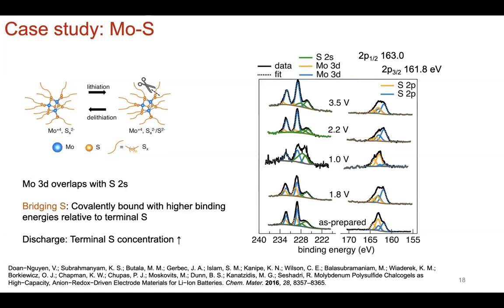Even then, the limitation is that you're human and you can't press it down any more than you can to try to get it flat. So this is the best attempt at getting it flat using a standardized preparation technique. It's challenging, probably an understatement.